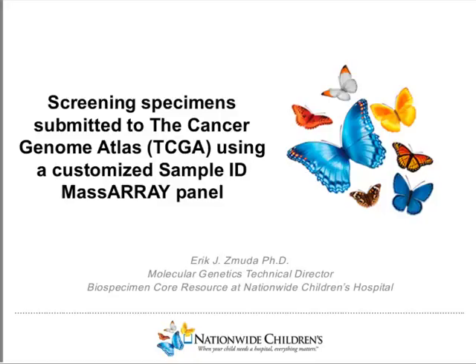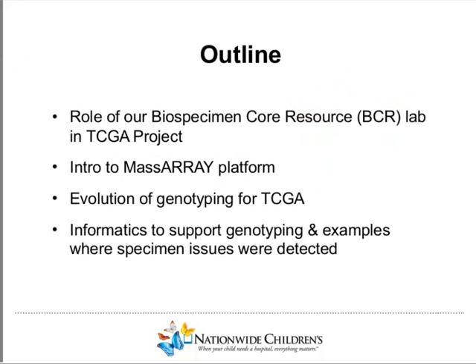Welcome, Dr. Zmuda. Well, thank you for that introduction, Allison, and hello, everyone. My pleasure to share with you today, as a user of the MassARRAY system, our experience genotyping tumor normal samples submitted for TCGA. So as an outline for the talk on slide 2 here, I'm going to touch on 4 main points for today over the next 20 minutes.